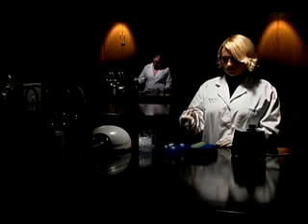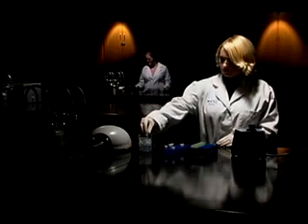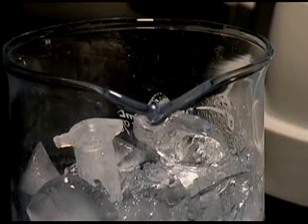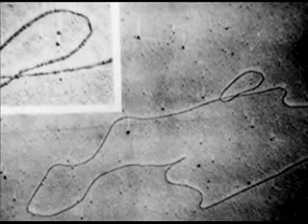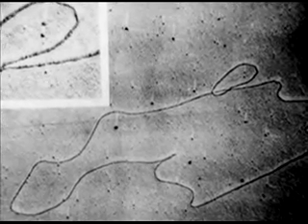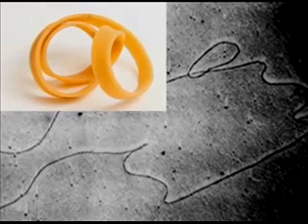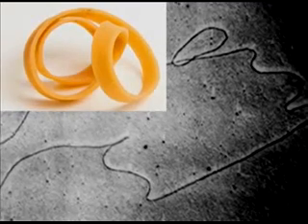The cell lysis solution contains sodium hydroxide, which will break down the proteins, RNA, and some DNA. The solution also contains a detergent called sodium dodecyl sulfate, or SDS. SDS dissolves the cell membrane and denatures proteins. Plasmids are circular chains, but are normally found in a supercoiled state, like a rubber band that's been twisted until it coils itself into a little ball. Because supercoiled DNA is so tightly twisted, the alkaline solution won't break it down.